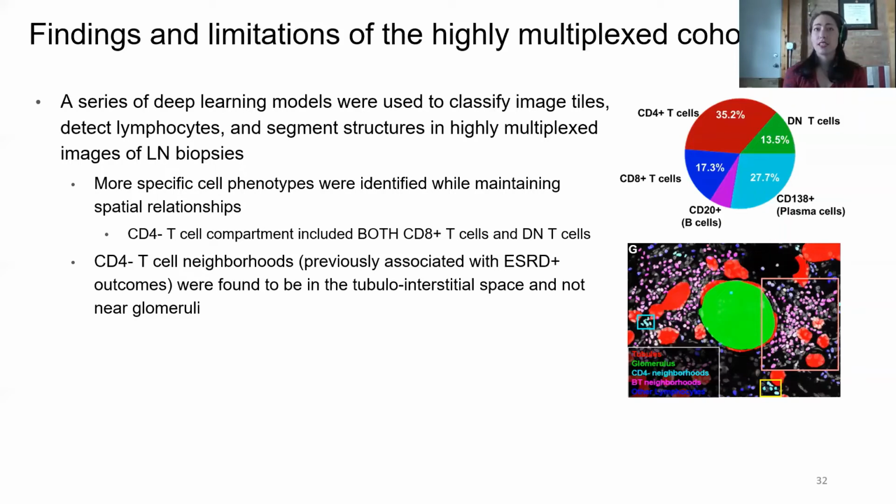We haven't done a direct computer-assisted quantification of that. That was just done manually because there's just a handful of images, but definitely gamma delta. You have an idea yet of whether the CD8 positive or the gamma deltas are really the bad guys in this? We do not know yet, no.